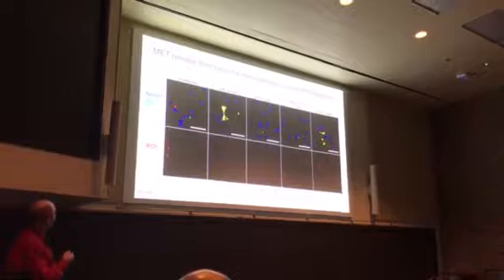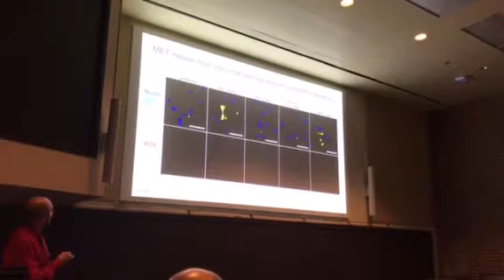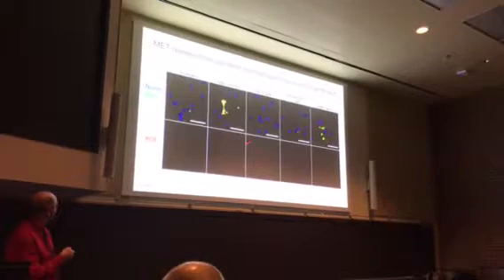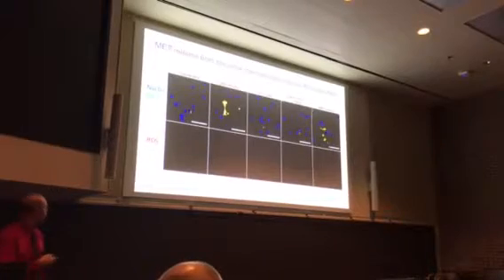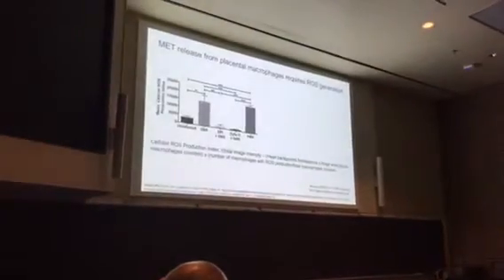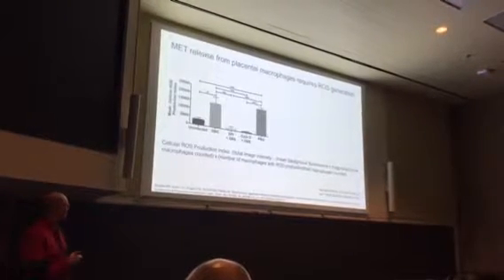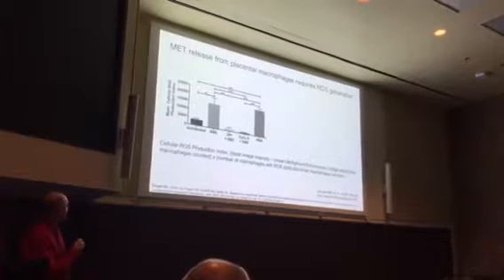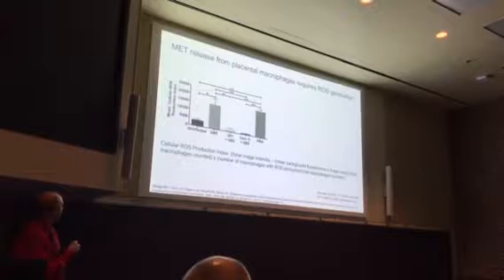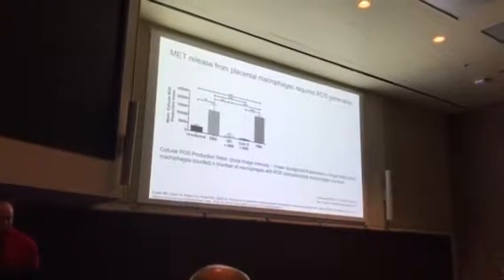Compared to those uninfected cells that generate a little bit of reactive oxygen species, GBS infection and PMA treatment drives a lot of ROS production in these cells. We see very little in both DPI and cytochalasin D. And if we actually calculate this into an index that takes into account the total fluorescence, the number of macrophages that are there, and those that are making ROS, we can see that GBS infection and PMA treatment drive ROS production up, and if we pre-treat with cytochalasin D and DPI, we lose that response.